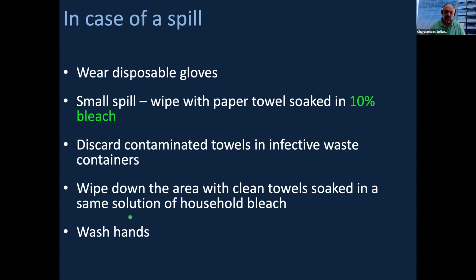If you want to be sure, 10% bleach is great, but it leaves a residue, so you have to clean it up with water.